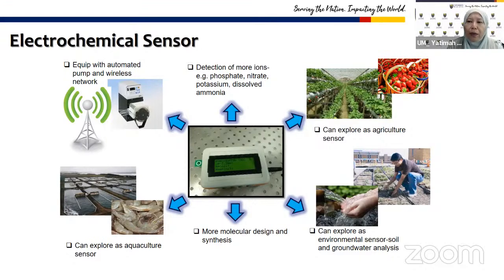So overall, I think this zoom in to electrochemical sensors is important, because we can see that there are quite a number of applications, especially where you can use the equipment straight in situ so that you can do your measurement.